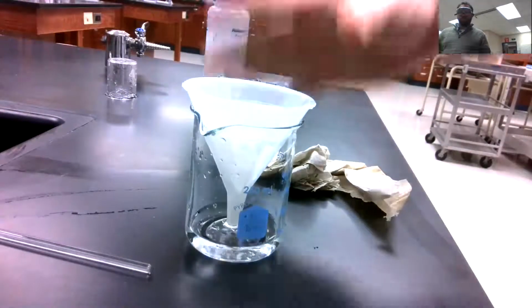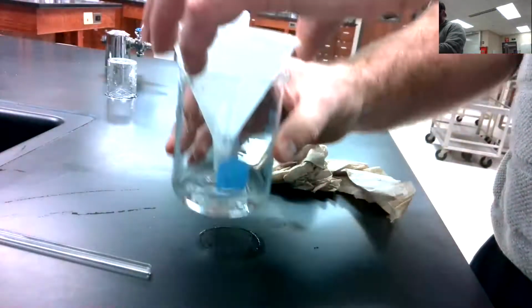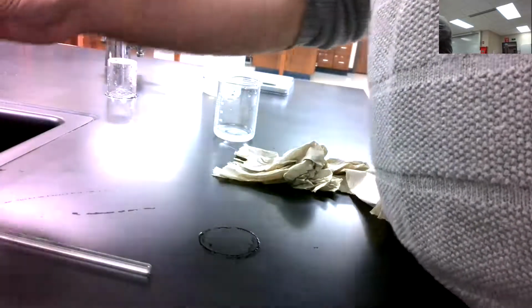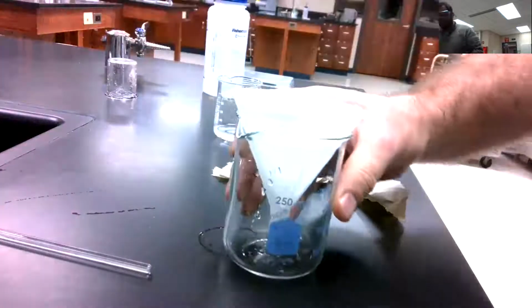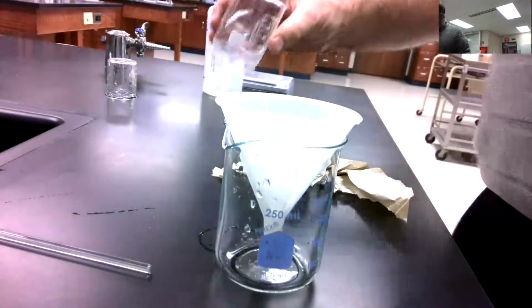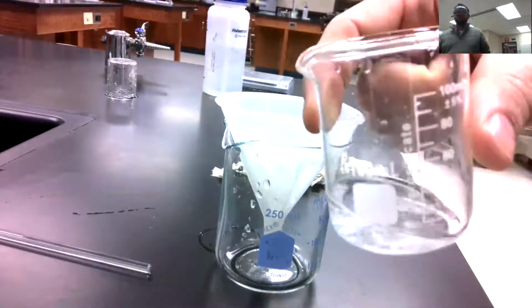So since this is still clear, I know I haven't lost any product. I'm going to go ahead very carefully and pour out the filtrate. Sometimes when it starts to build up around the funnel, it seems to slow down. And still got this little tiny bit of salt left. I don't know if you guys can see that or not.